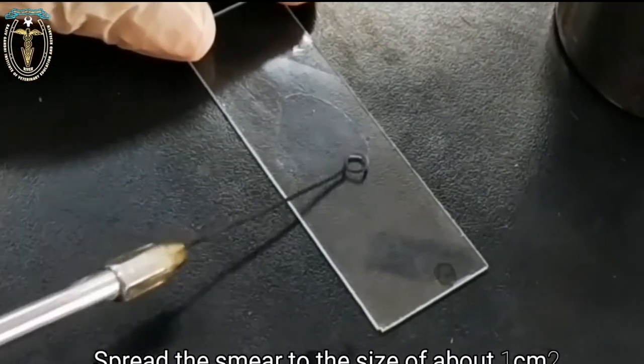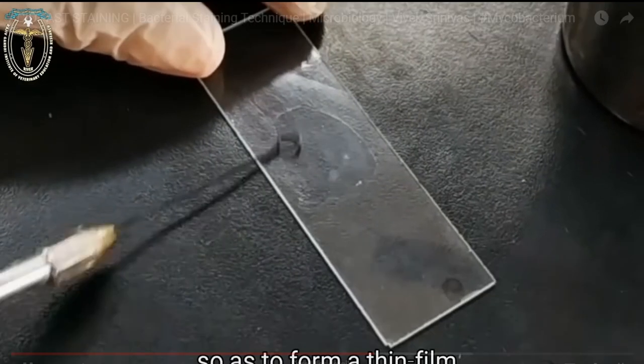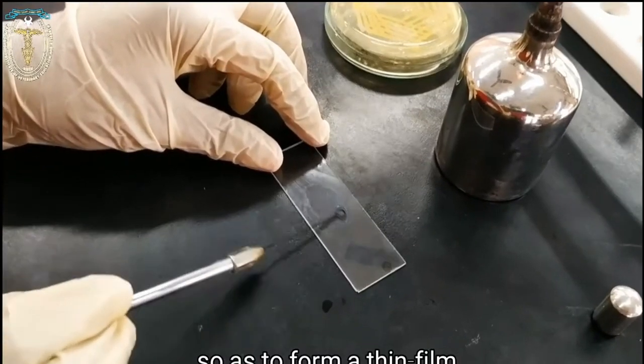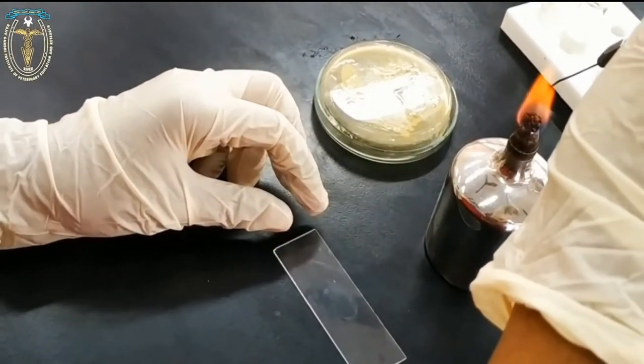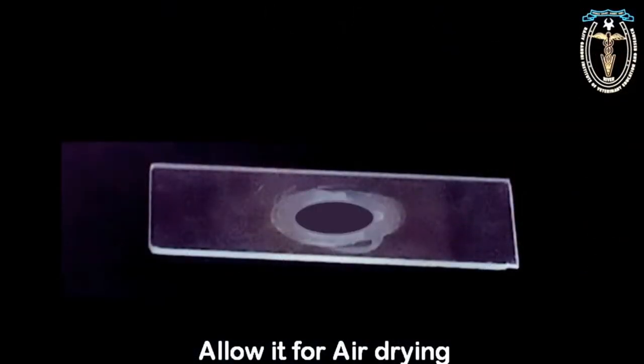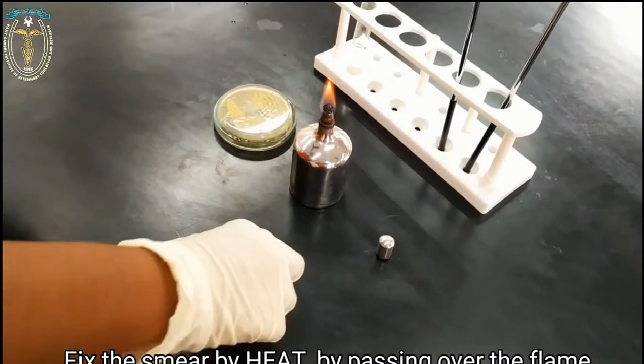First, add the strong carbolfuchsin staining solution over the smear. Cover the entire smear with the staining solution. Heat the stain until vapor just begins to rise. Do not overheat. Allow the heated stain to remain on the slide for 8 minutes. Great care must be taken when heating the carbolfuchsin. Only a small flame should be applied under the slide using an ignited spirit lamp. After 8 minutes, allow the slide to cool down, and then wash it with the distilled water.